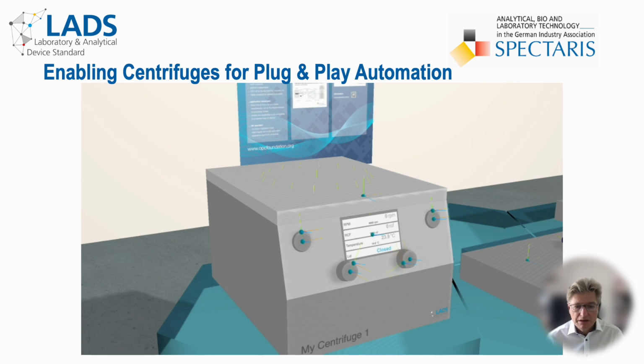By turning the lower right dial, the speed set point for the next run can be defined. Again, the corresponding relative spatial location object is a great help. By pressing the Start-Stop button in the upper right position, the centrifuge run can be started.